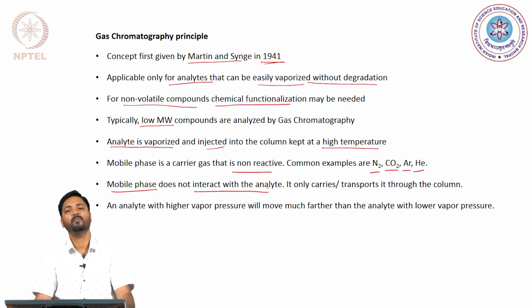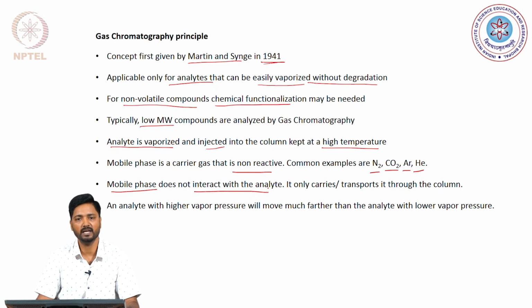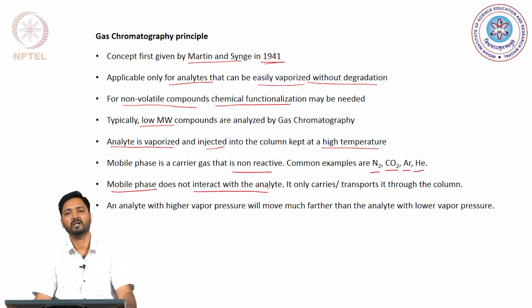Since the mobile phase itself is gaseous, it is not dense enough to have a particular interaction with the analyte of our interest. Moreover, the gaseous mobile phase is also non-reactive and often non-polar. So, it usually will have no particular interaction with the analyte, and this is a very important key difference between gas chromatography and the other chromatographic techniques.